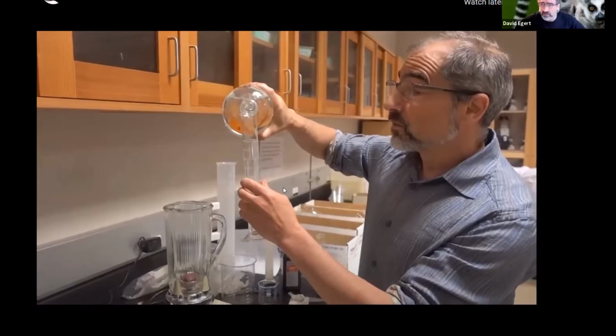What will stay at a constant? The concentration? No, concentration is just about volume versus enzyme. What does a phosphate buffer do? Why is it going to be important here? Resists the pH. Control for the change. pH. Yeah, it's going to stabilize the pH.